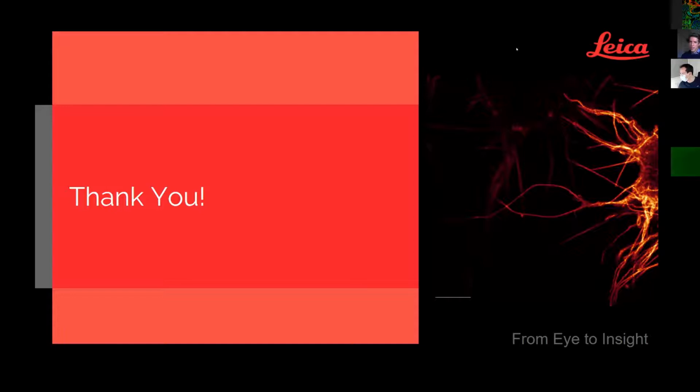Okay, so you have another question. What is the sample depth that you can measure using TauSTED? So how deep can you go? Okay, thanks for that question. That goes in the direction of one example that I have shown in the presentation just now.